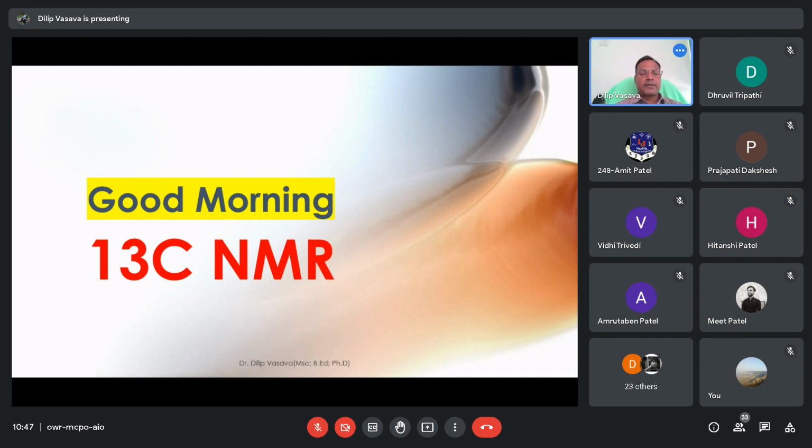So we will take it one by one. Before 1H NMR, I wanted to discuss the 13C NMR. So you have seen 1H NMR, and here we have written 13C NMR. 1H and 13C are both isotopes of the respective element. Normal carbon is 12C, so 99% of carbon available on the planet is 12C, which has the quantum magnetic spin I equal to 0.